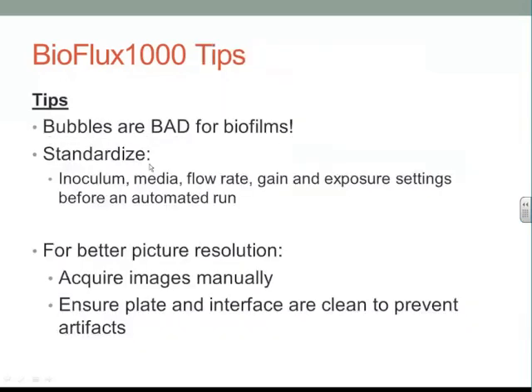So I also included a couple of BioFlux tips. I know some of these may seem a little childish or like, no duh, but the first one here is bubbles are bad for biofilms. Now this sounds funny, but in reality, if you get any bubbles in your system, it really is hard to grow biofilms. It will destroy them, and you'll have to waste the plate, and this is not what you want to do with the system.